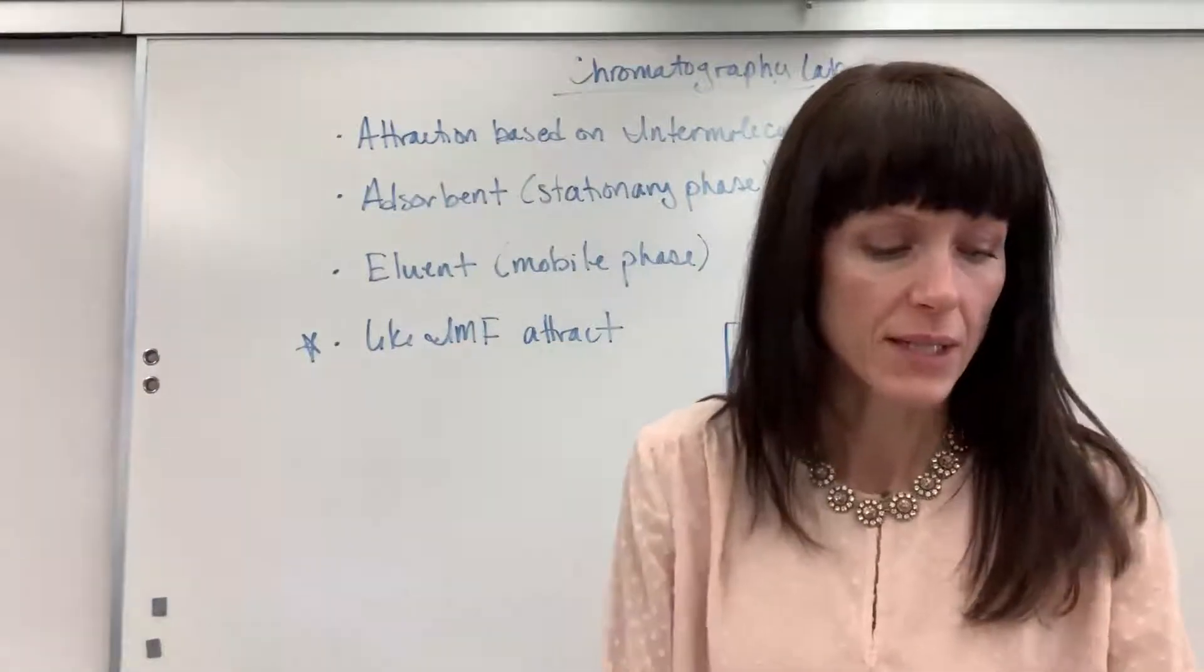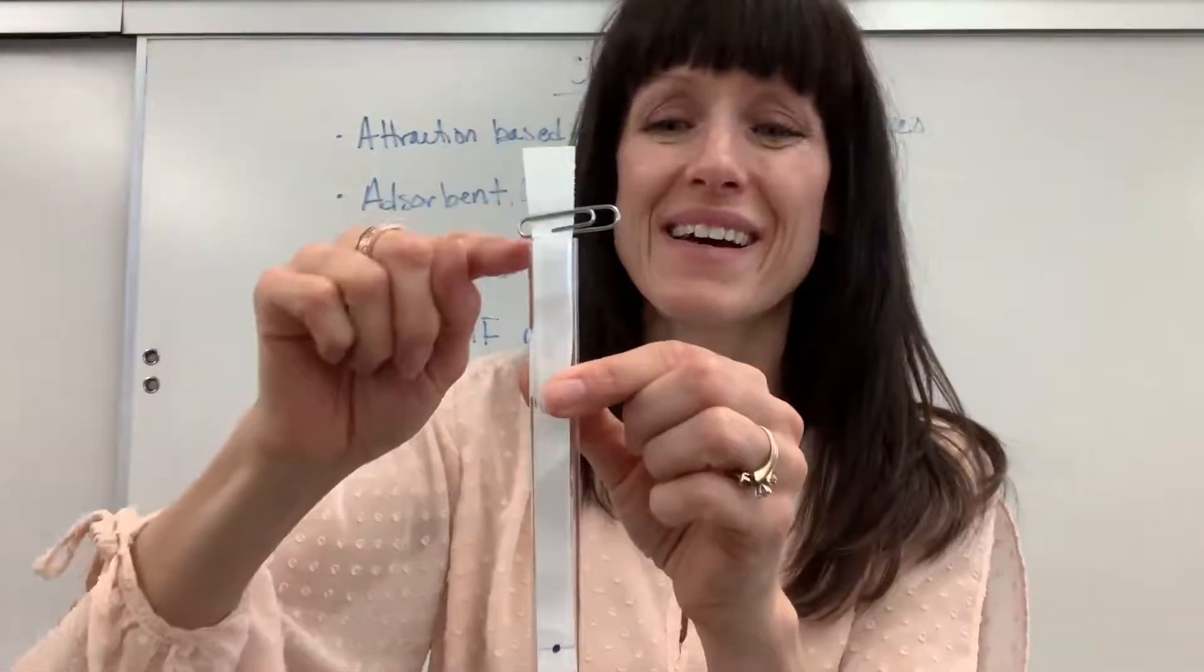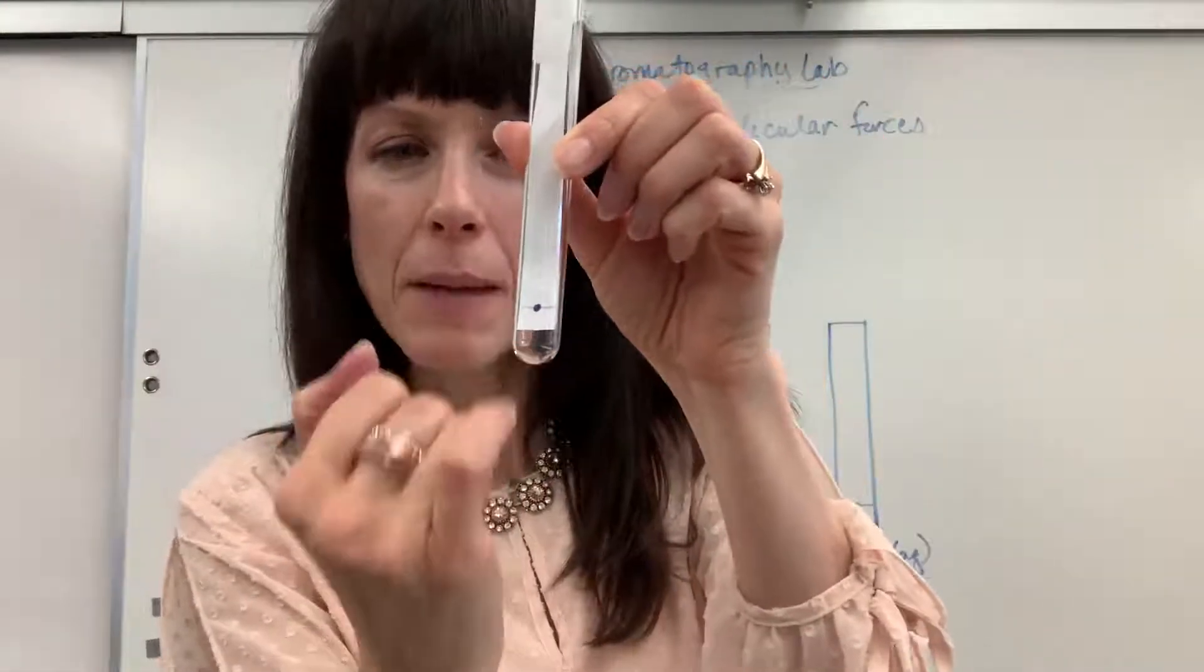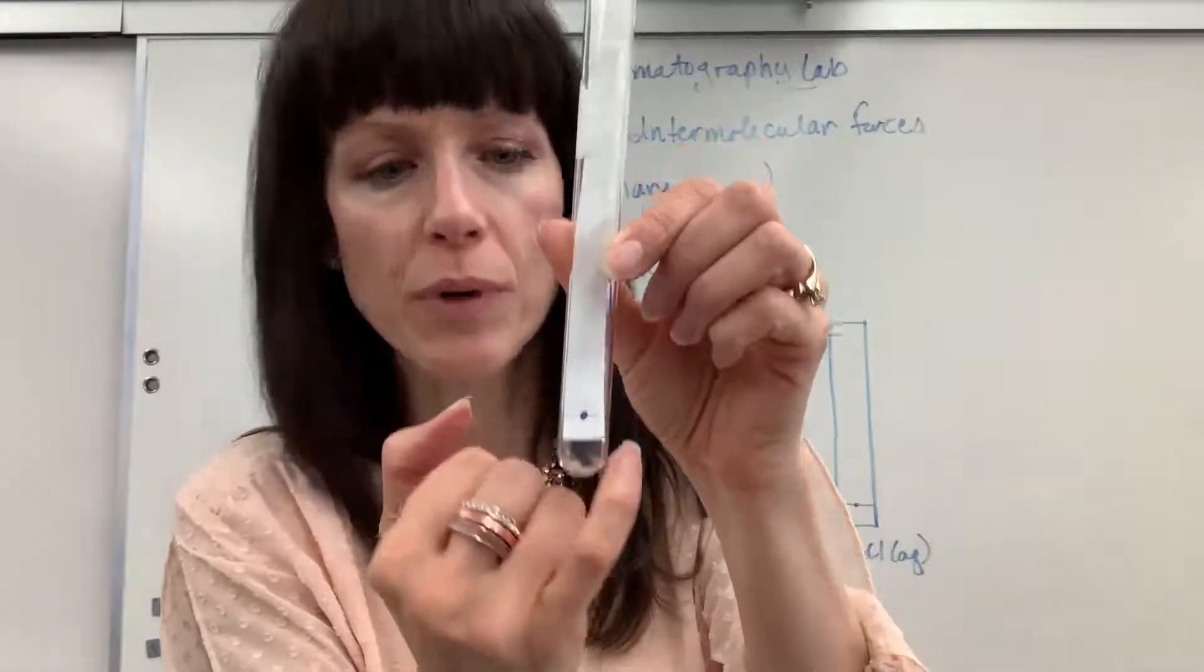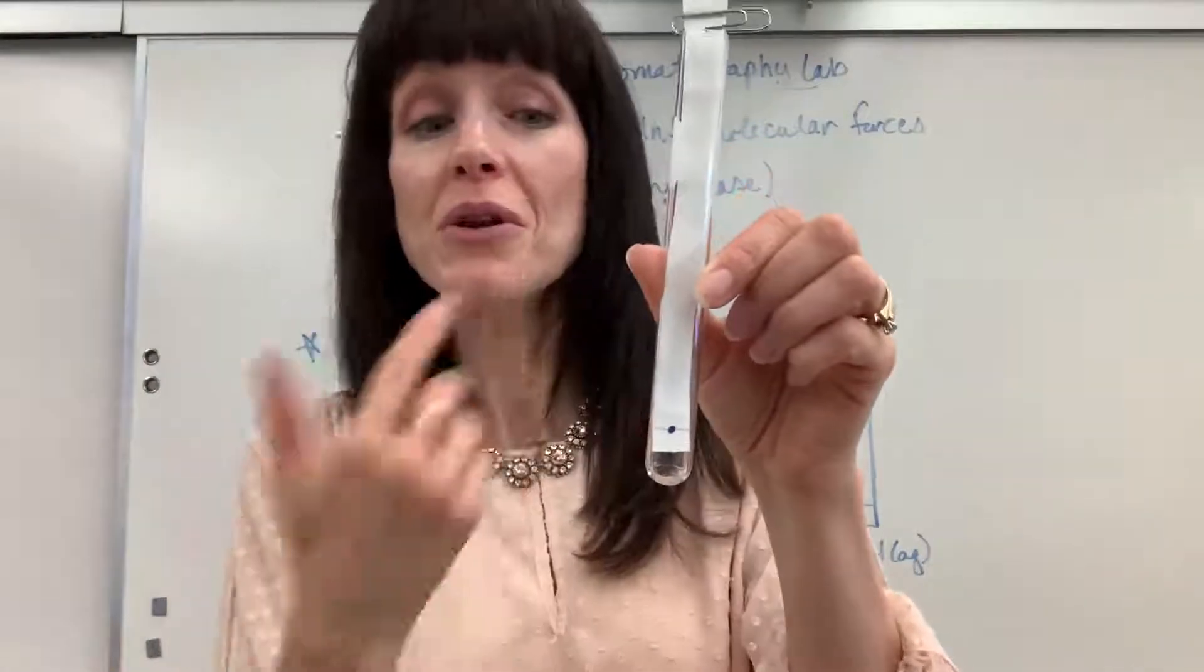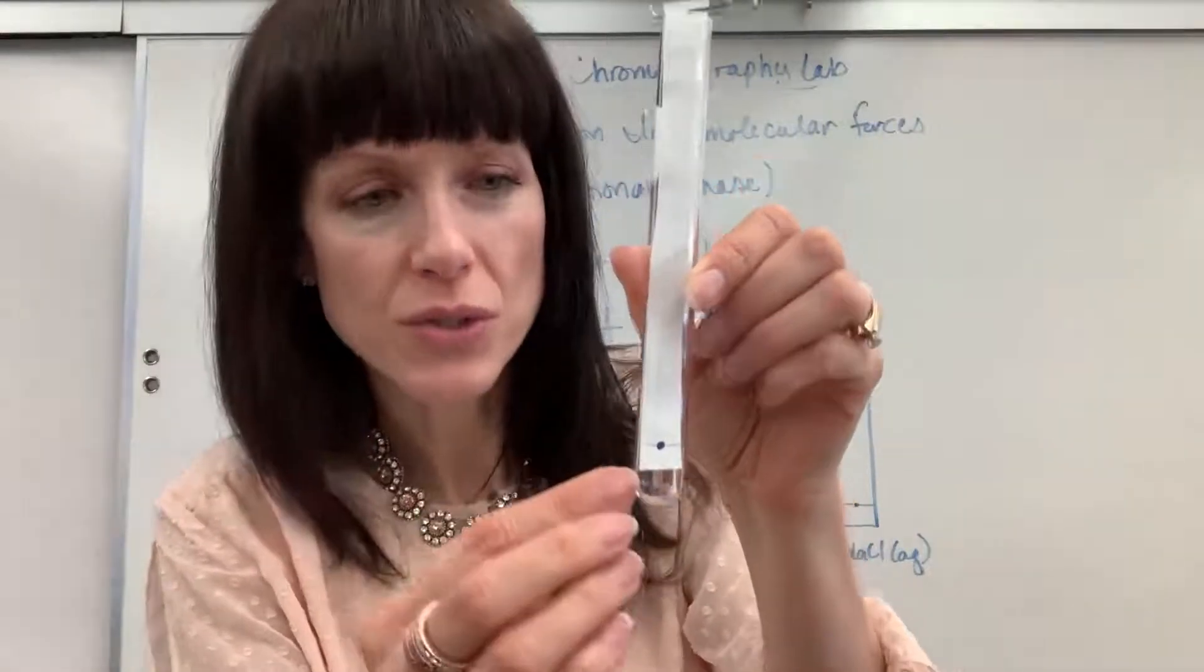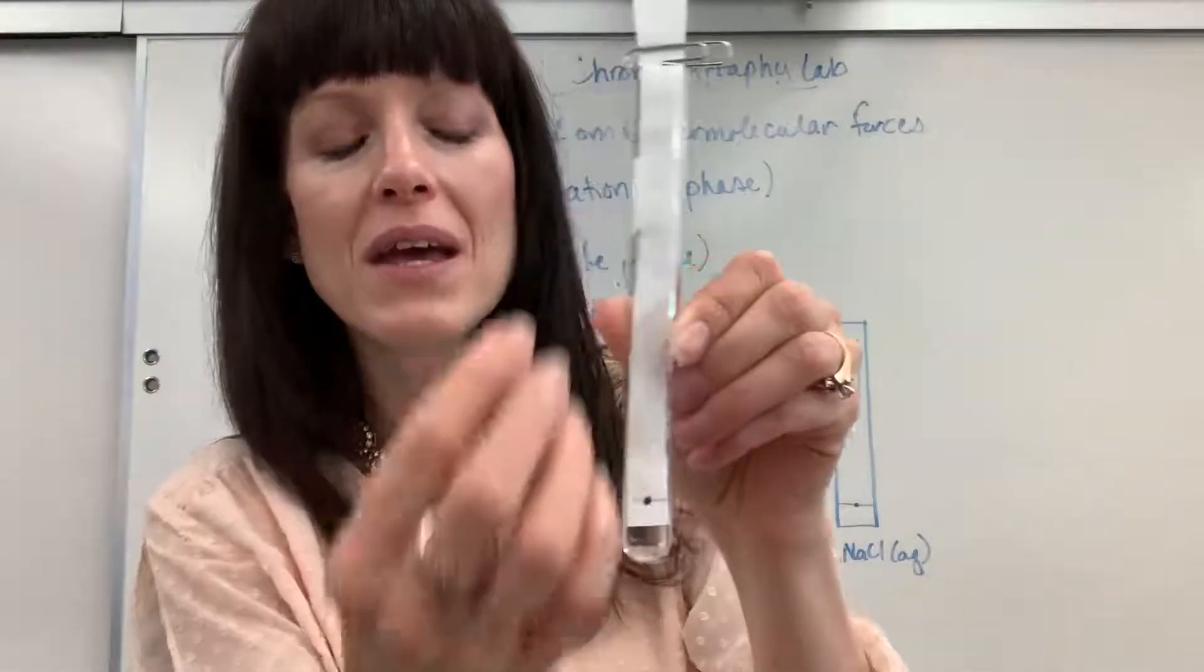So I would take a test tube, put my paper, my stationary phase, put this filter paper inside of here. I've already put the dot, and then the bottom of that paper just touches the mobile phase, the solution. So the isopropyl alcohol or the sodium chloride solution just barely touches it. And you know what happens, it's just like a paper towel. Through capillary action, that mobile phase, the solution, is going to absorb and move up that paper.